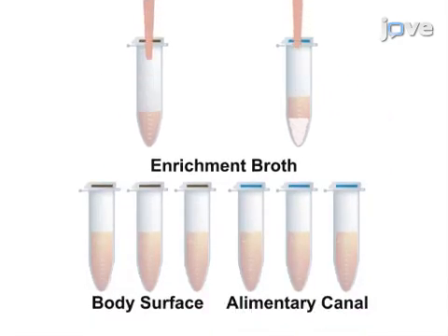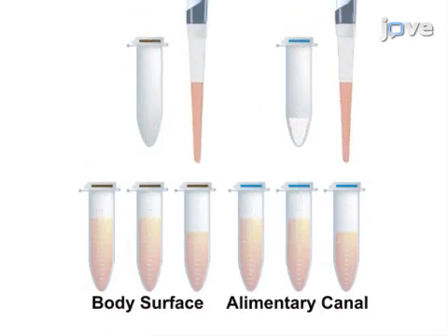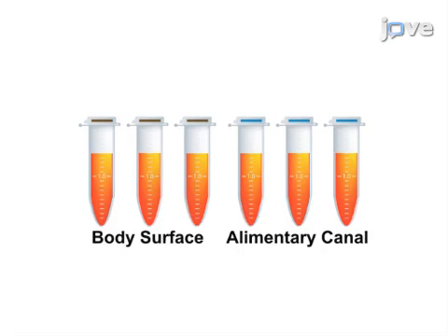The next step is to transfer the samples to pathogen-specific enrichment broth for bacterial growth, which will increase the concentration of the bacteria above the detection limits of the assay.